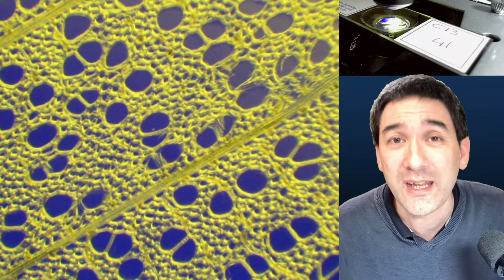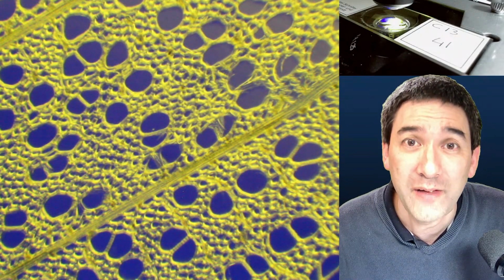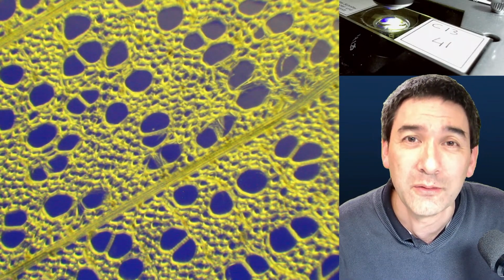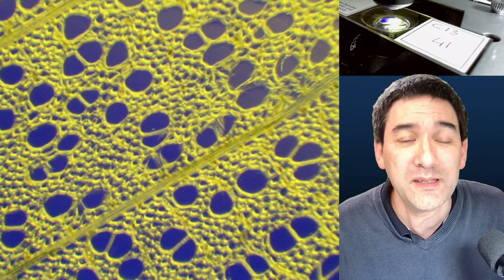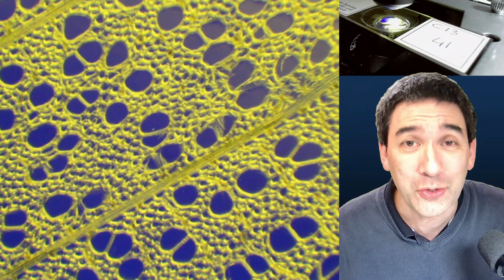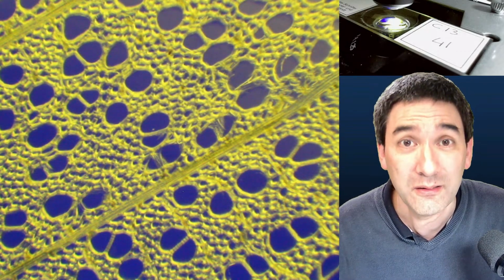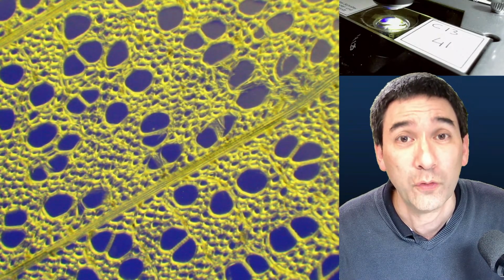And if you change the brightness at low light levels of halogen, for example, the lamp is more red, and if you turn up the brightness, it becomes more blue. This can be a little bit of an issue concerning white balance sometimes, right? For some people, it's a question of taste. I've heard that some medical doctors who have been trained for many years using halogen microscopes prefer to stick to the halogen lamps. But many modern microscope manufacturers have switched over to LEDs.